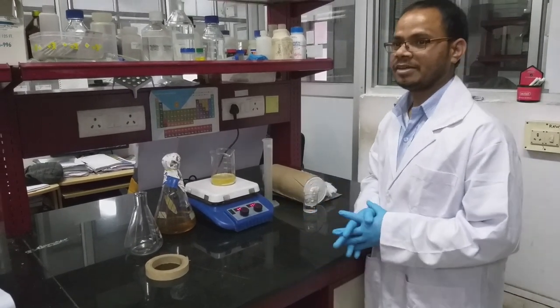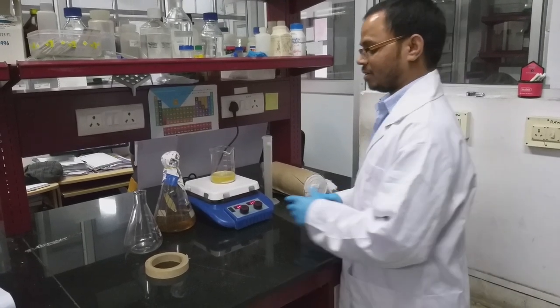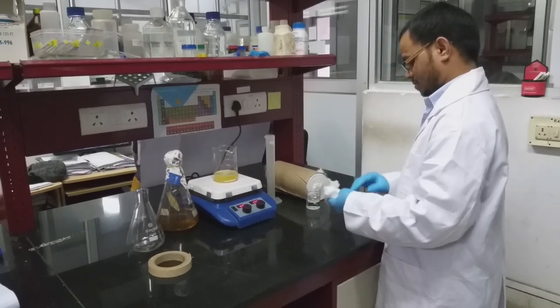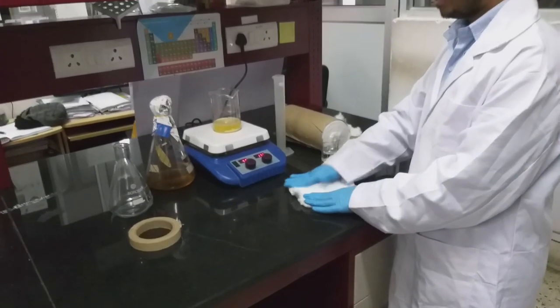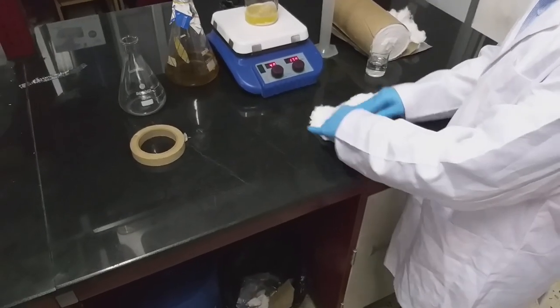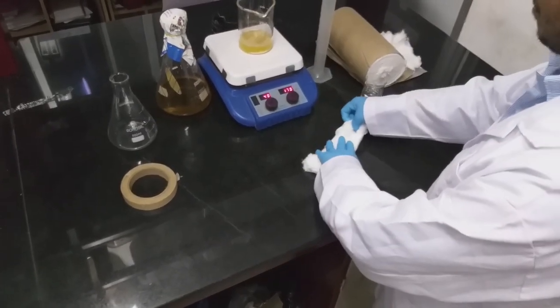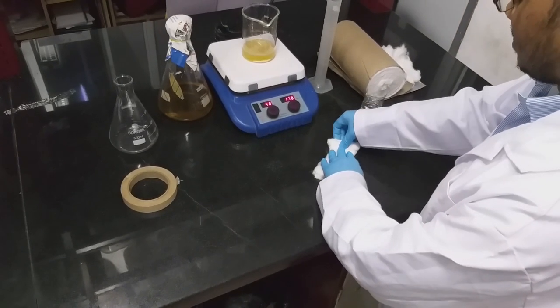While it is stirring, we have to prepare a cotton plug for the flask. For preparing the cotton plug, you have to take one thick layer sheet of cotton. With your two hands, fold it like this.